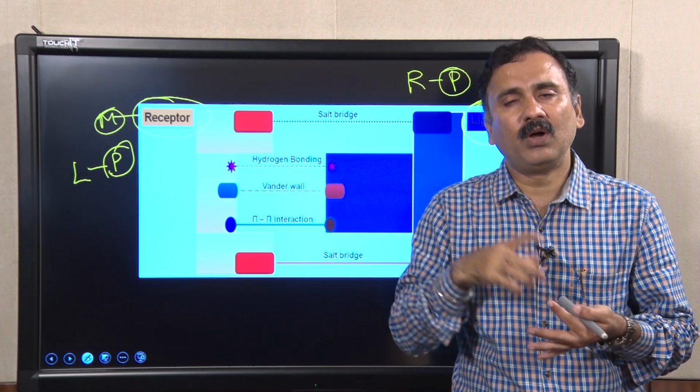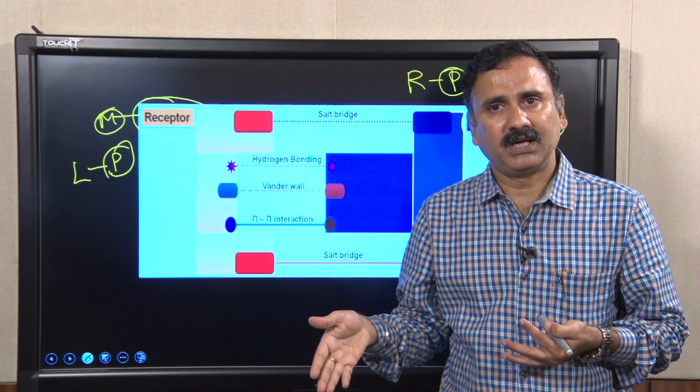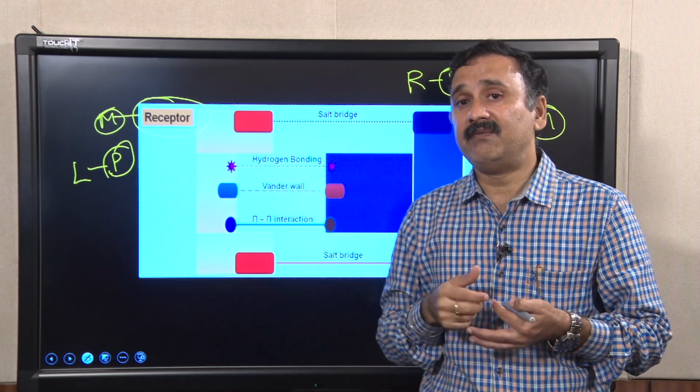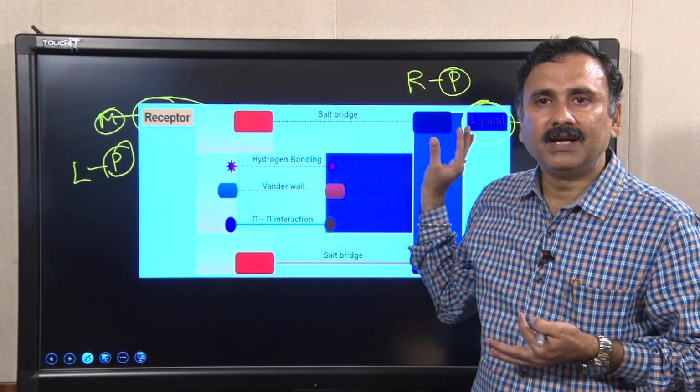Depending on which one is easy to perform, because coupling the receptor or the ligand to the protein is always done by recombinant DNA technology, which means you have to generate the recombinant protein if you would like to utilize affinity chromatography exploiting the receptor ligand complex.